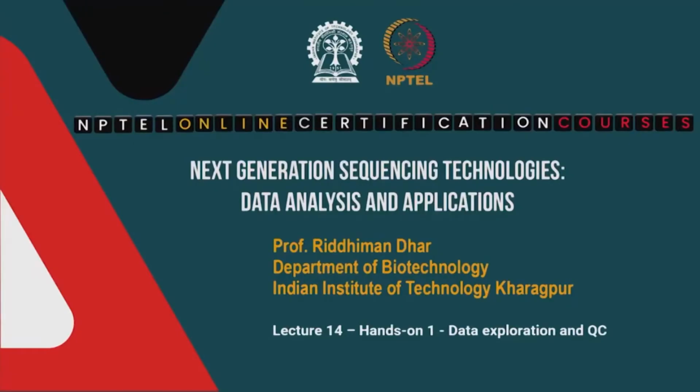Good day everyone. Welcome to the course on next generation sequencing technologies, data analysis and applications. So far we have set up the system for the hands on and we have learned basic Linux commands. So, we will utilize those commands today to look at the data and then we will do the quality control of a test data. So, let us start.